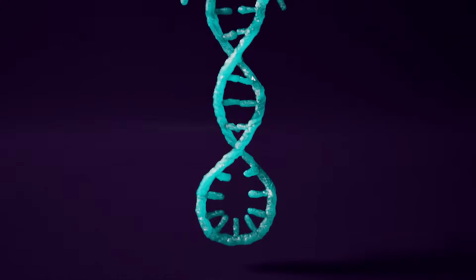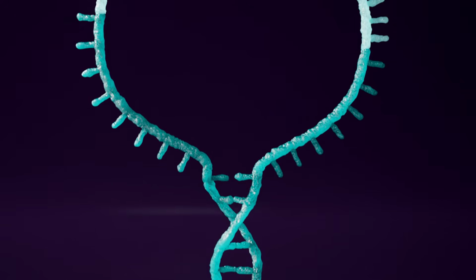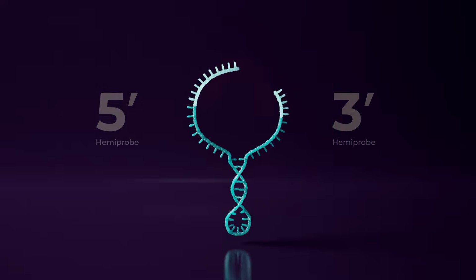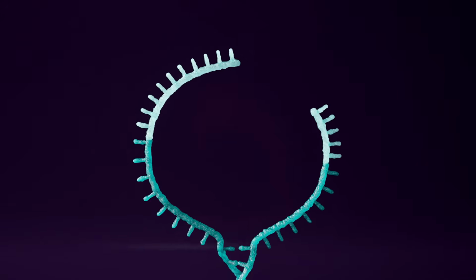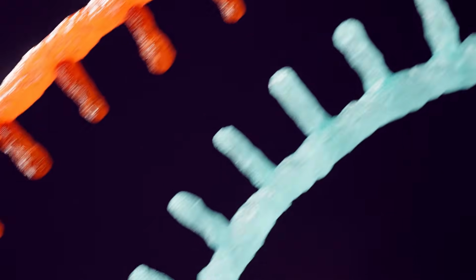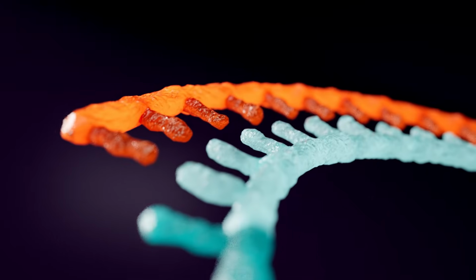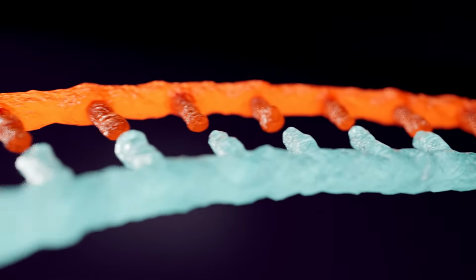Our two-tailed primer is coiled into a hairpin structure, with a generic structure in the middle. It has two targeting regions, known as hemiprobes, which are complementary to the microRNA. Taken by itself, one of these hemiprobes is too short to bind to the microRNA. However, when two form part of the same molecule and one of them does happen to bind, the local concentration of the other is so high that it binds too, thus forming a stable complex.